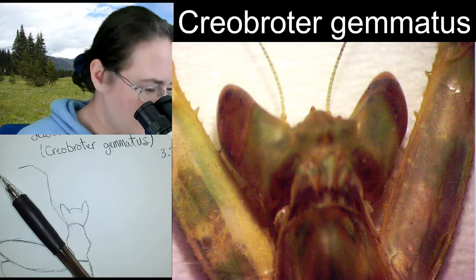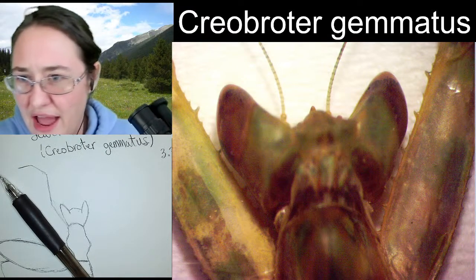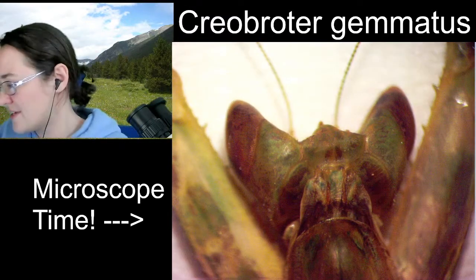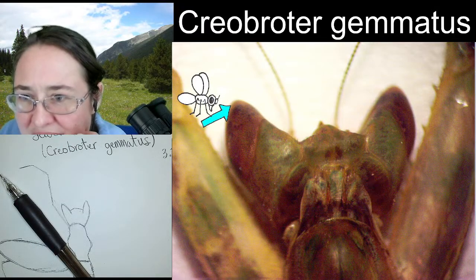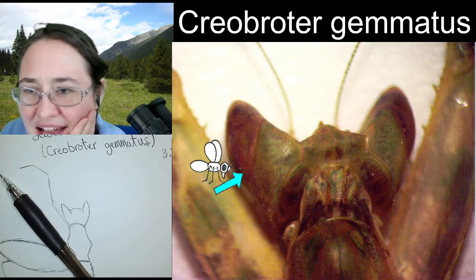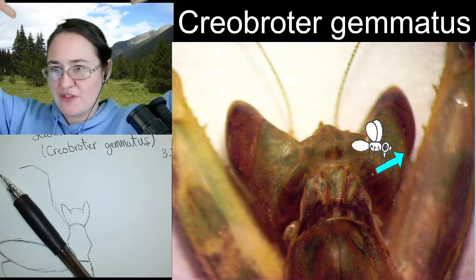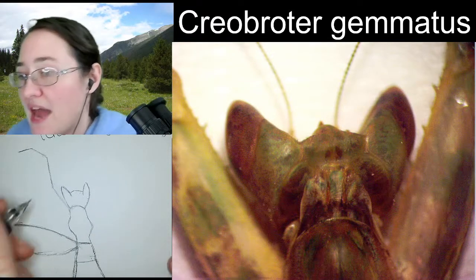Alright, so now what I'm doing is I'm trying to see about the actual size of this compound eye, because now that we are zoomed in and checking out the head of this mantis here, I'm noticing that not this whole piece is actually a compound eye. The compound eye is up here at the very point, but if you see there's this vertical line right here, that is actually the compound eye. Here, and then over here, this. So the compound eye is on the tip of these two pieces, but is not the whole piece, like I originally thought when we were looking at it from far away.